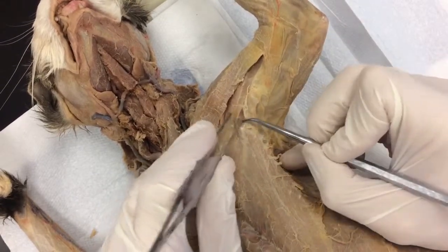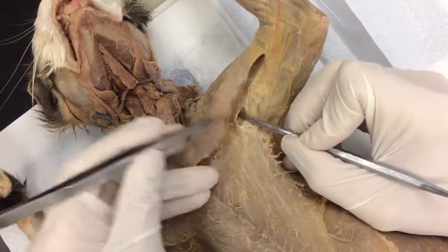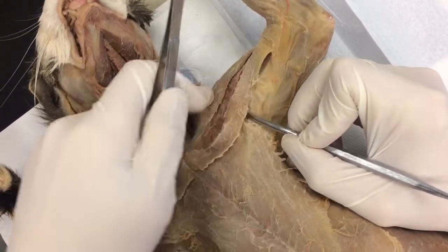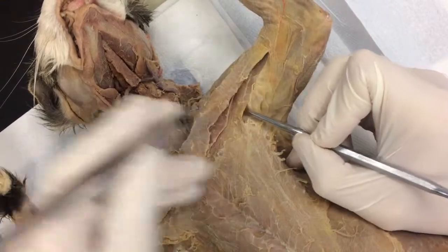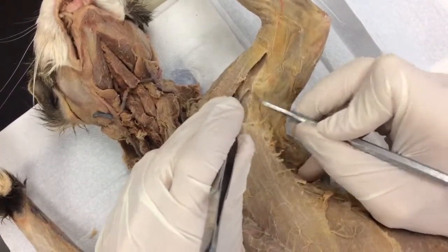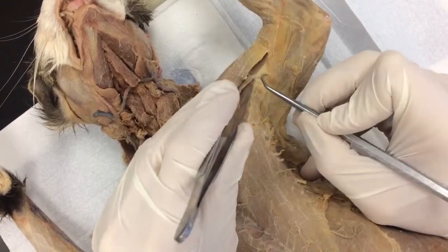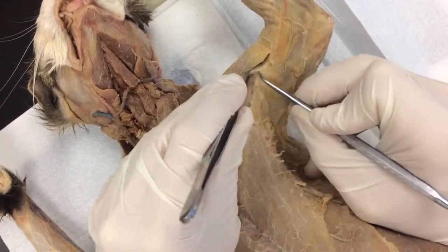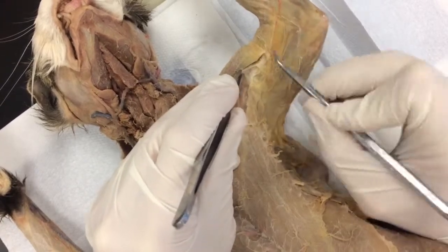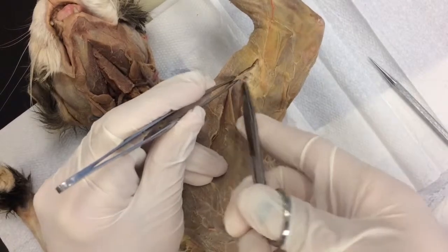Switch to the round side — push down. We're not going to dissect the upper margin here just yet; we're just going to do the bottom today. Now if your cat's really, really wet, be careful. I'm using the round side and just pulling towards me. You may have to switch to the scissors and just get that started.